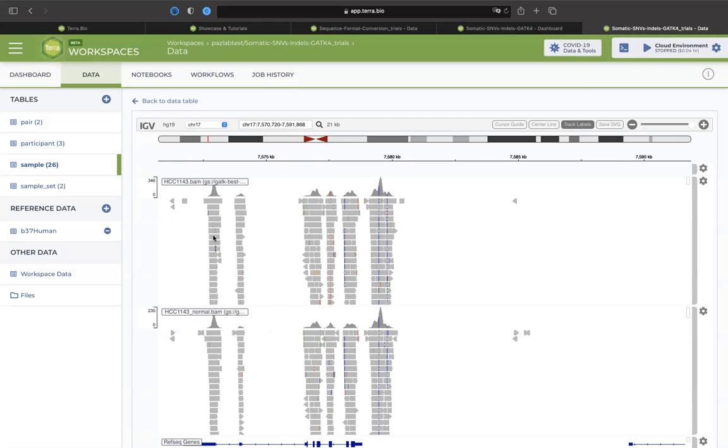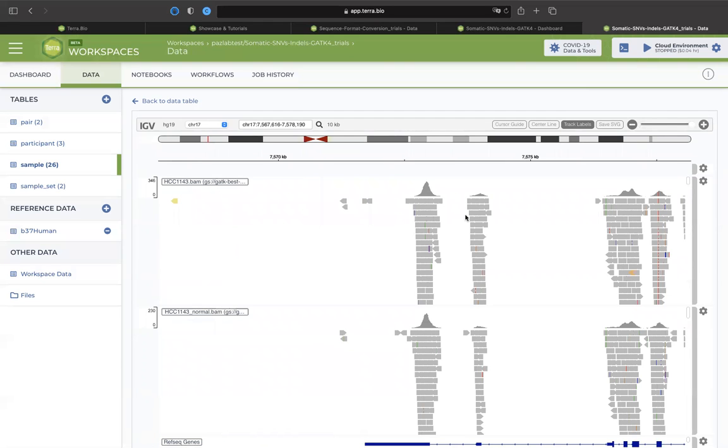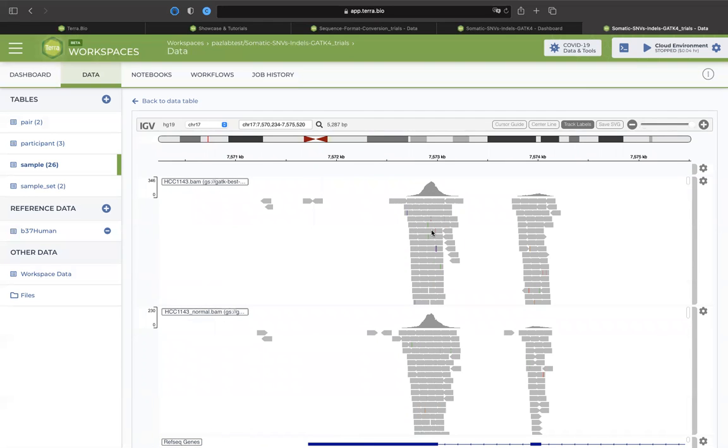Now what we could do is to also zoom in more. Double click and zoom, right? Yeah, you can zoom. We can also save as SVG, so it takes a snapshot. We could also use a guide. So we do something like this.